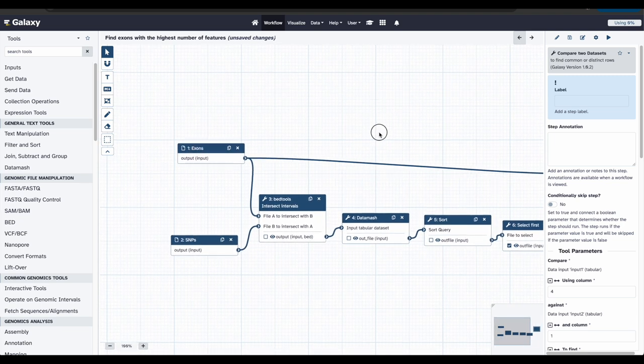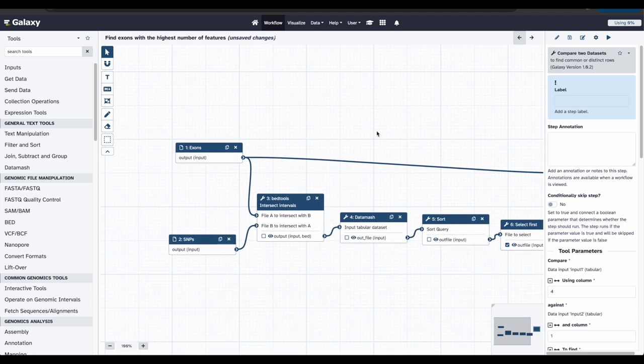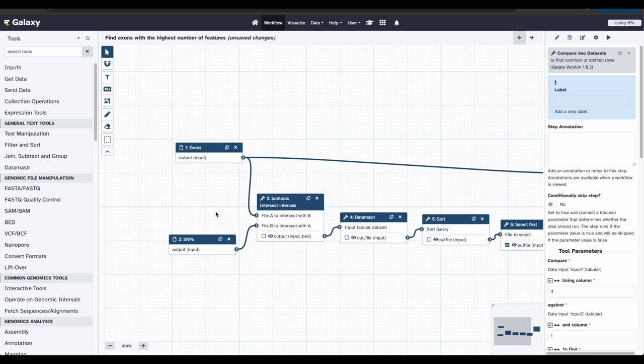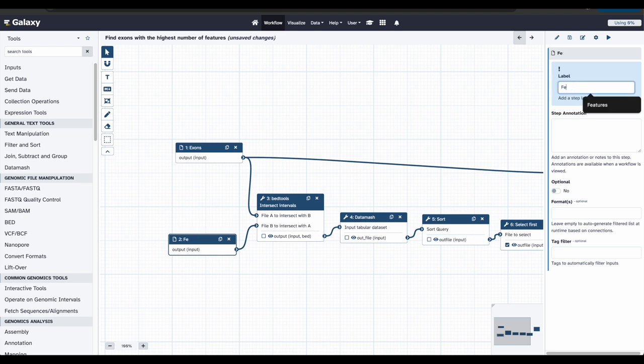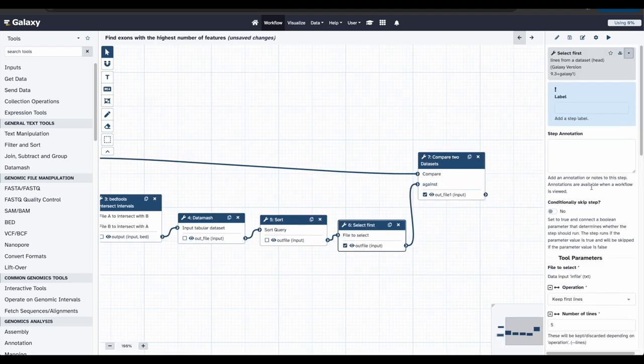Back over here, the box named Exons is named OK, but we want to update the SNPs name since the workflow doesn't have to be specific to SNPs because there are other genomic features we could use. So instead of SNPs, let's change the label to Features. We will do that by clicking on our tool, and then over here we can update our label to Features.